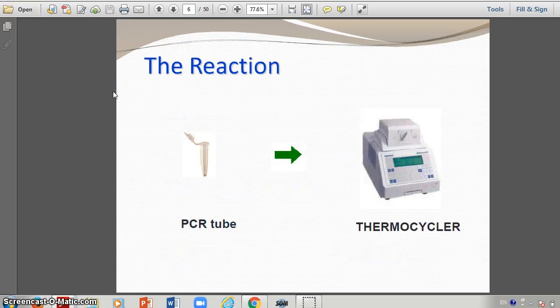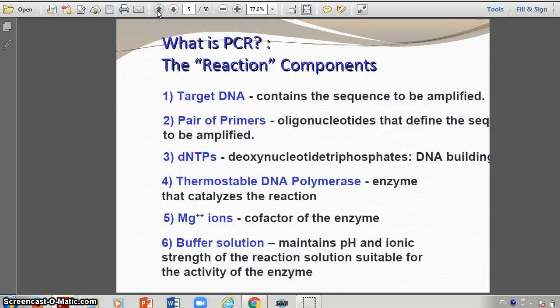So that is about the chemicals. Then other than that, what is in case of instrument? So this machine is used for PCR. That is called a thermocycler. And these are the enzymes.